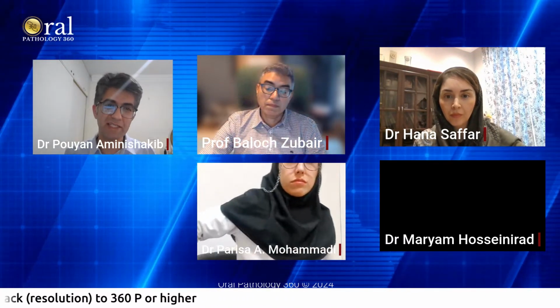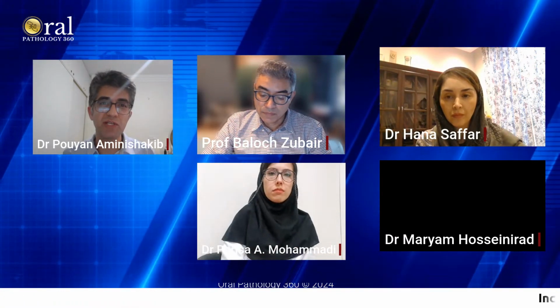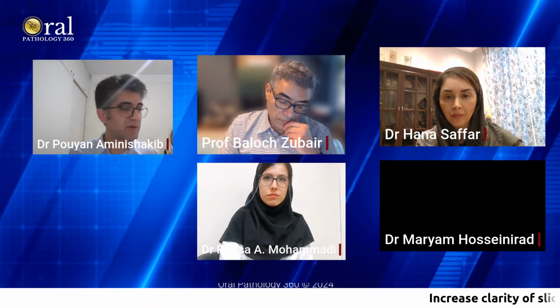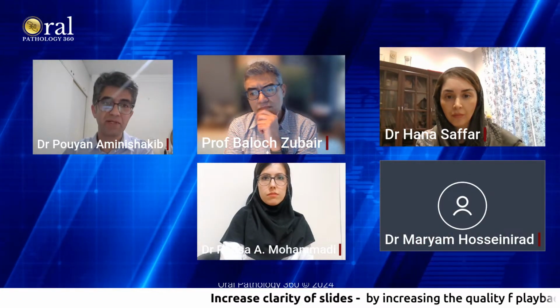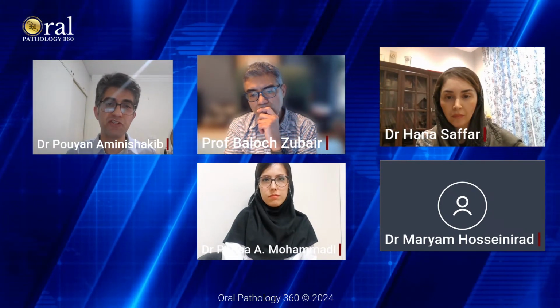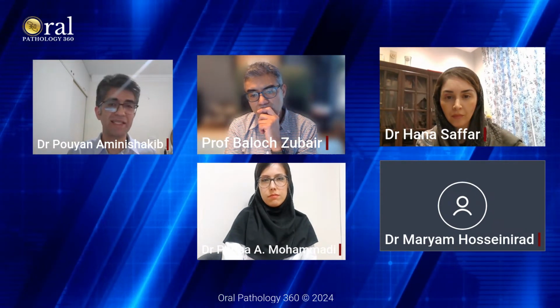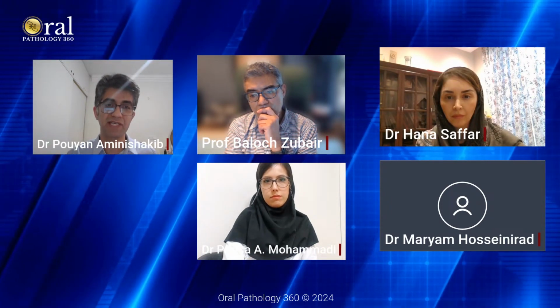Dr. Baluch, let me get started this part with a general question. Is fine needle aspiration biopsy a reliable approach to differentiate malignant salivary gland tumors from benign salivary gland lesions?